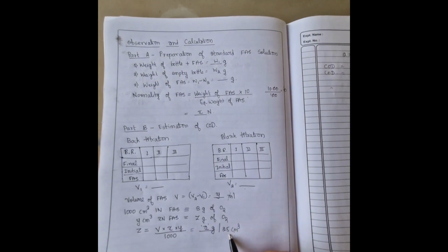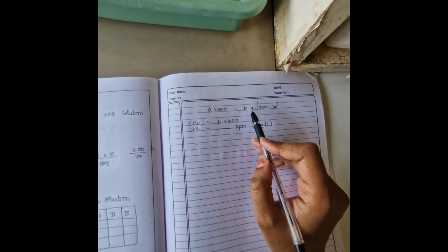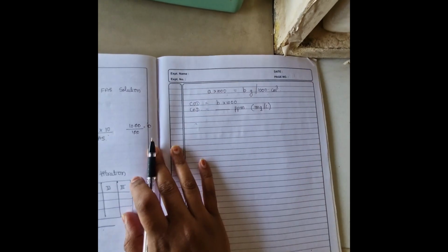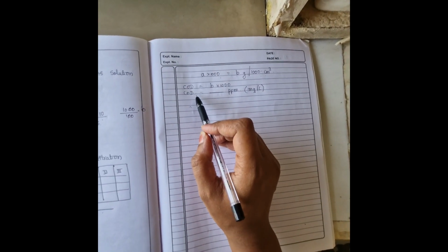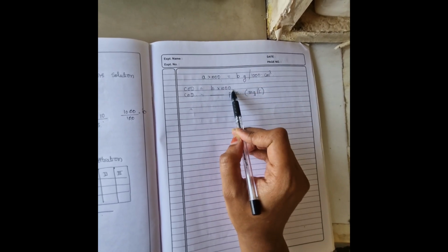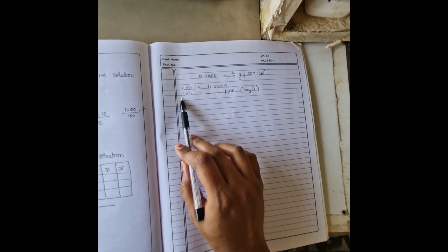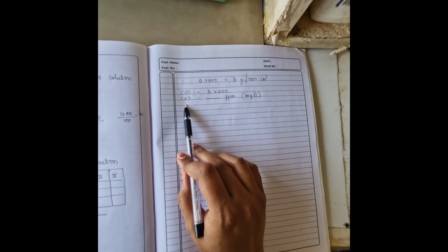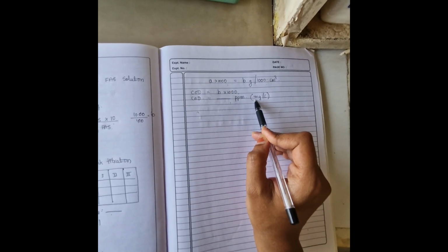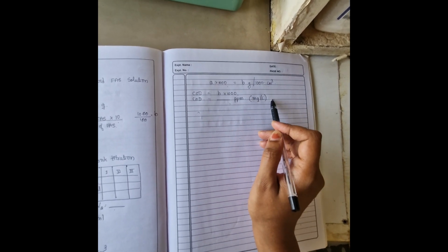Now we have to convert this to per liter. So multiply the value by 1000, and you will get B amount per 1 liter or 1000 ml of the analyte. Then lastly, we need the result in mg per liter, that is ppm, parts per million. So just multiply the obtained quantity by 1000 and you will get milligrams per liter. So finally the chemical oxygen demand or COD is the obtained value in ppm, that is milligrams per liter. So this is the desired result with unit. Thank you.